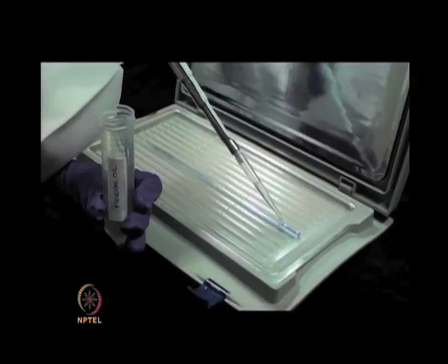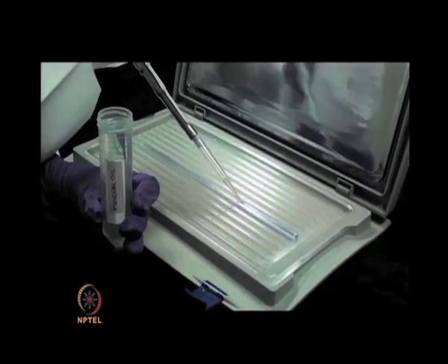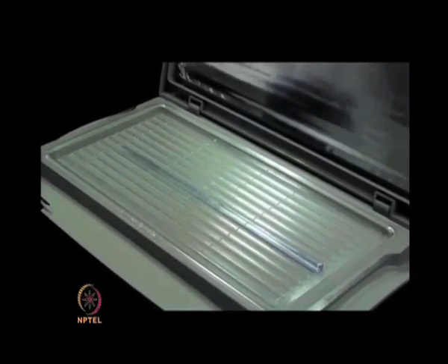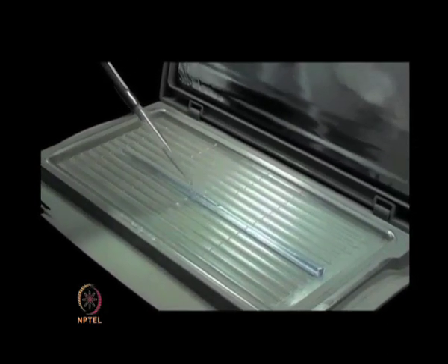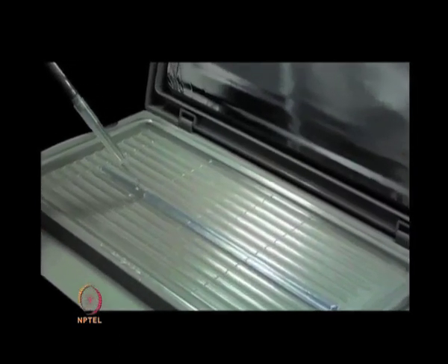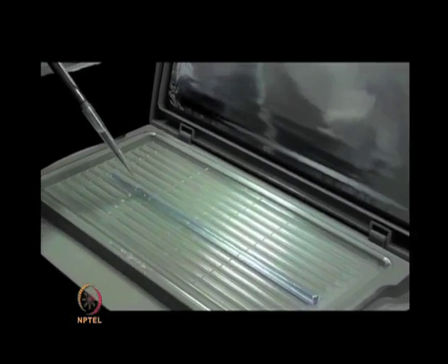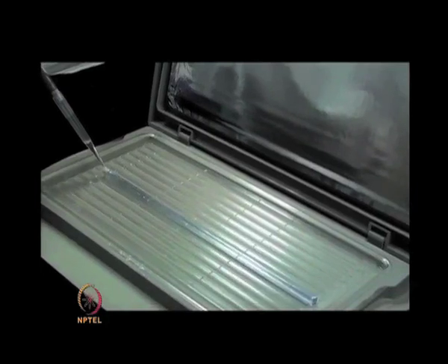After around 30 minutes, pour some mineral oil over the strip to prevent it from drying up. Cover the tray and leave it overnight to allow rehydration to occur.